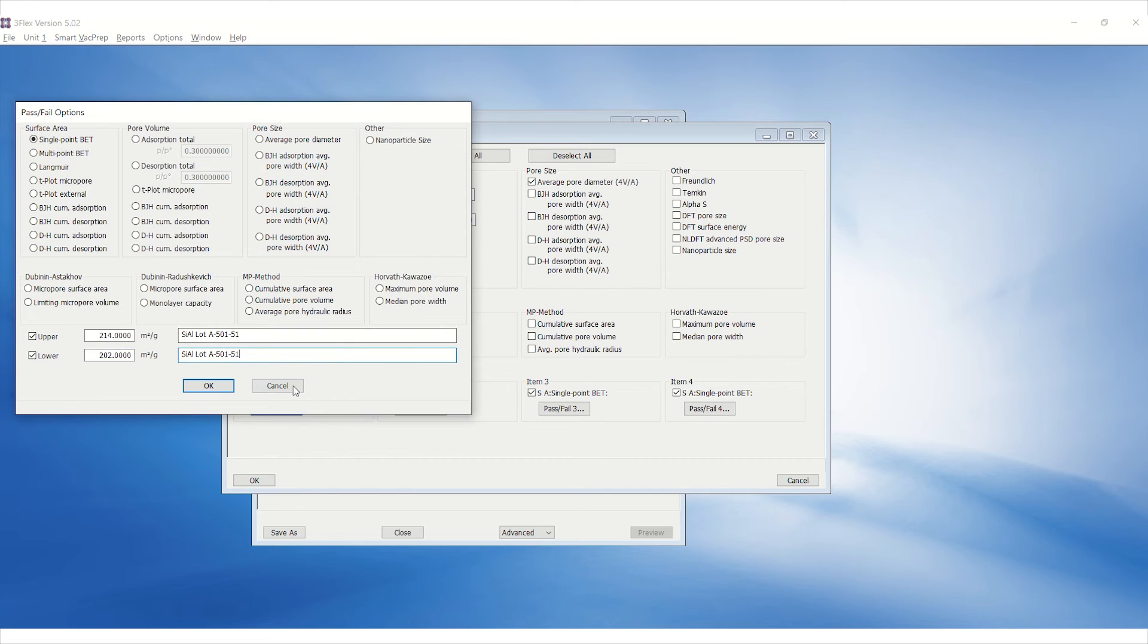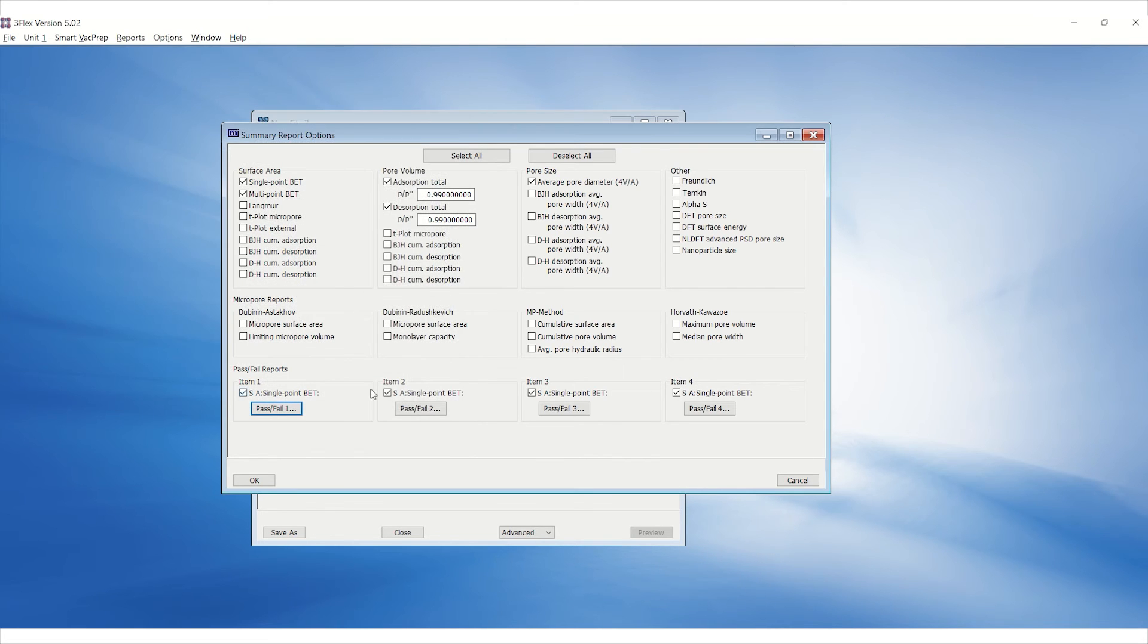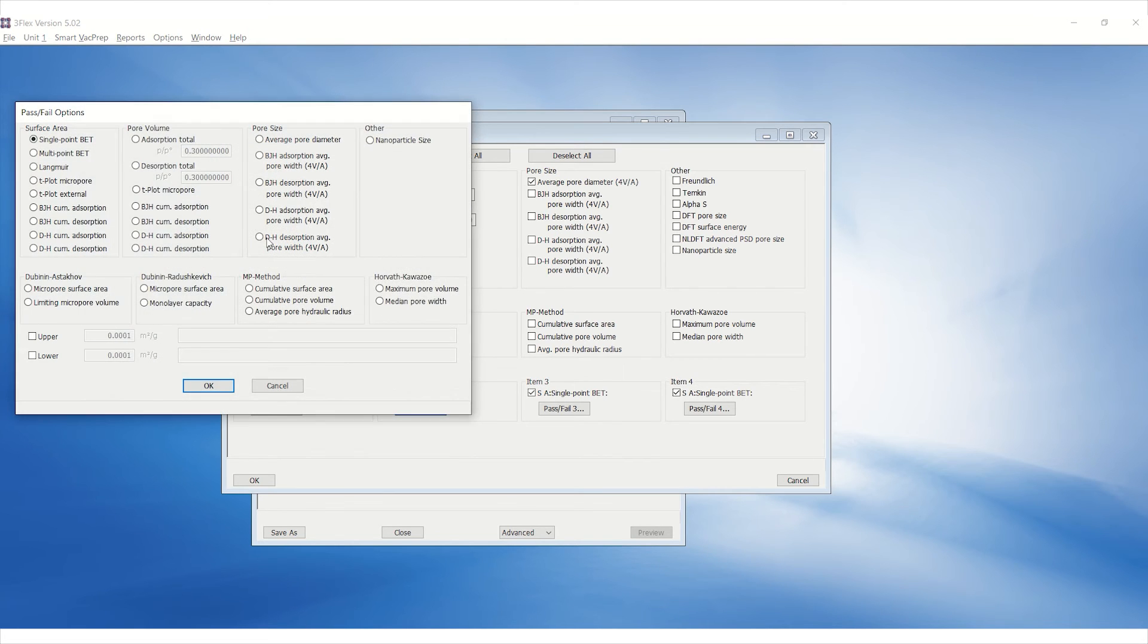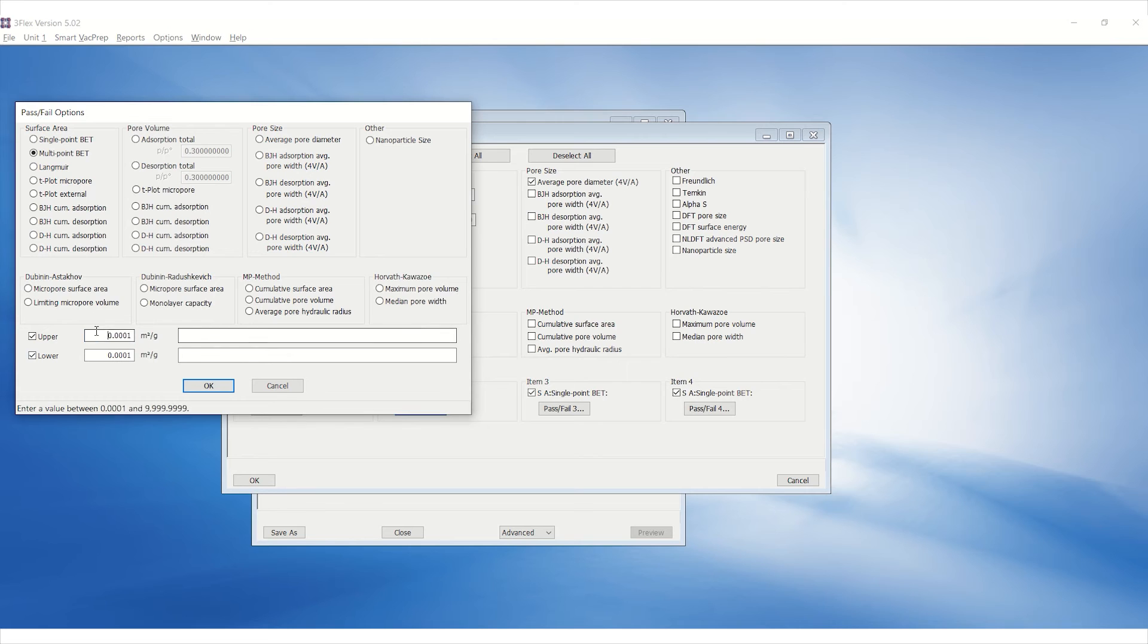Click OK to save. In the same manner, enter the upper and lower specifications for Multi Point BET Surface Area.